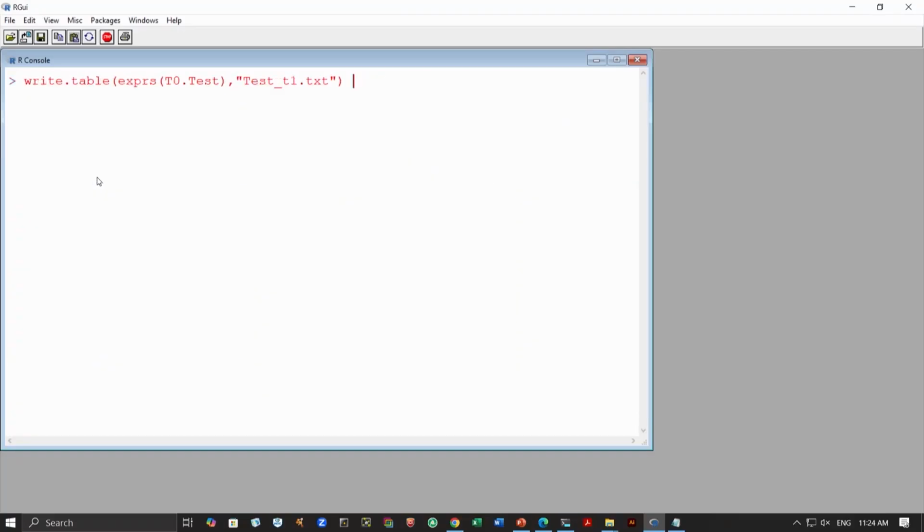So we will continue that for all time points. We do it for T0, T1, and T2.